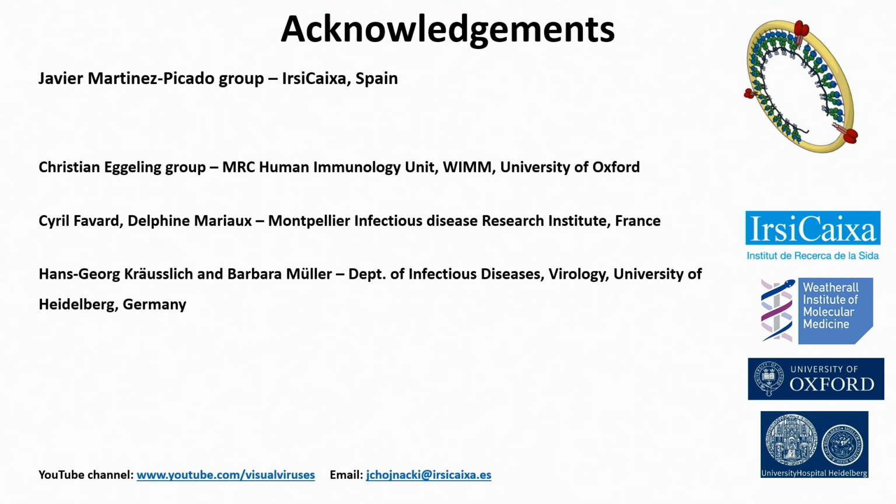Thank you very much. This was wonderful. I was wondering if you're considering, or have started working towards, looking at virus produced in myeloid versus T cells. Because we have been struggling, not us specifically, but the field in general, with techniques like flow virometry or lipid fingerprinting. So this sounds like it would be a lot simpler, to just look at the virions themselves and try to see if there is a different pattern of the lipid structure or the mobility maybe. I don't know.